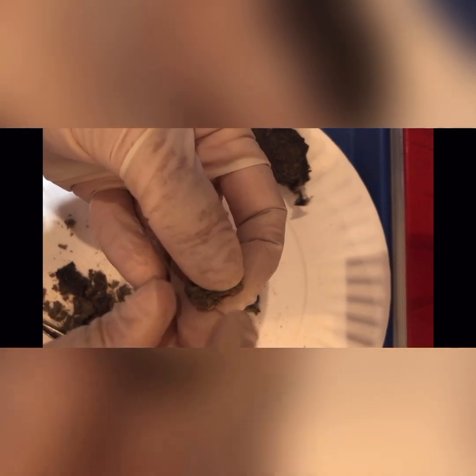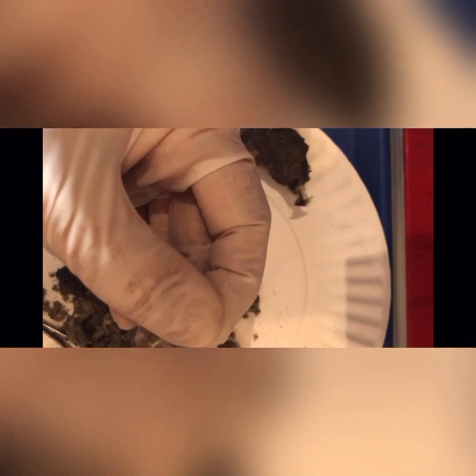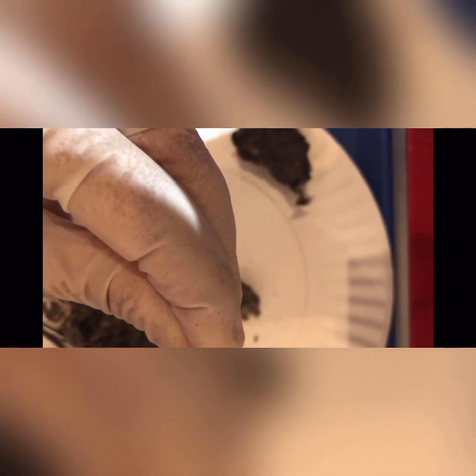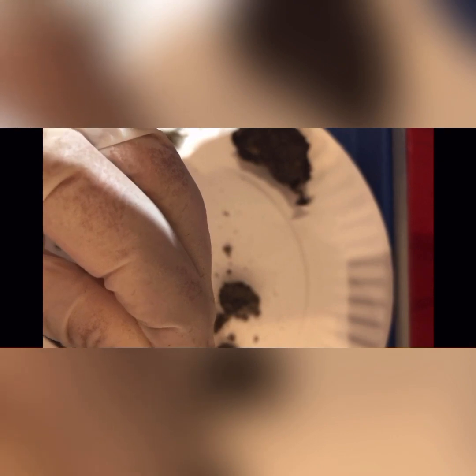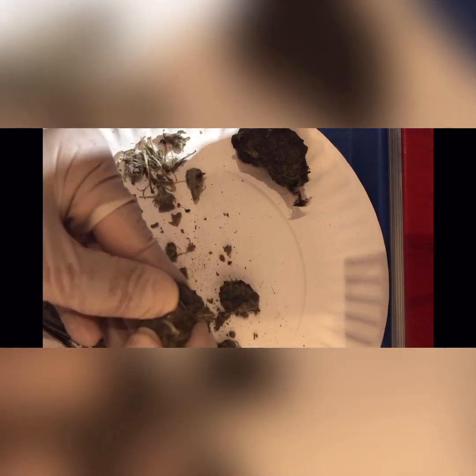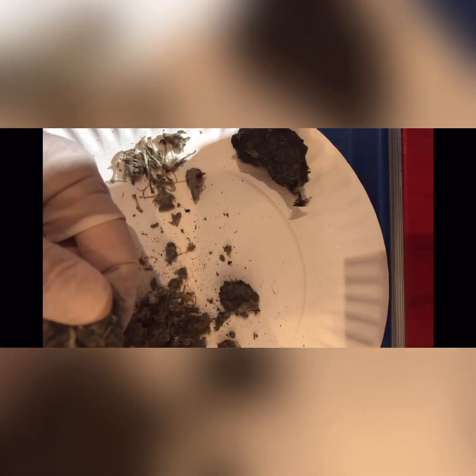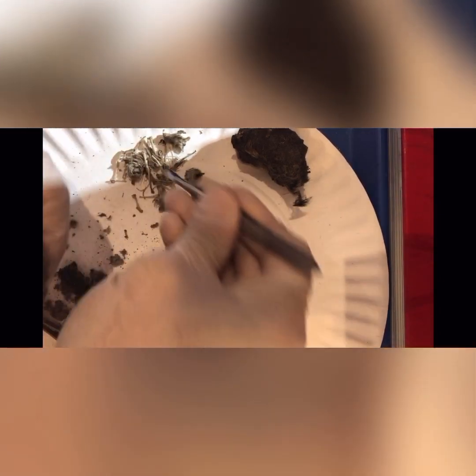the animal whole. It goes into its first stomach, where all the stomach acid is. Starts to break down the animal. Then it goes into the actual stomach where it gets digested. And then once it's digested all the meat and all the goodies, then the fur, the bones, the teeth, everything else here, I have another jaw. Everything else, all the exoskeleton gets regurgitated, comes back up through the mouth into this little furry pellet.